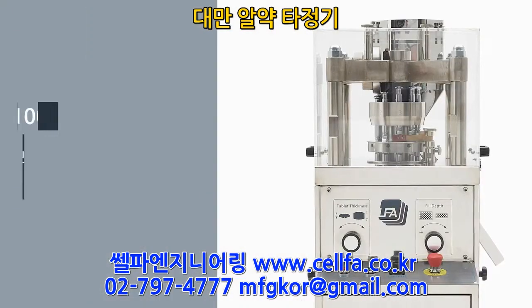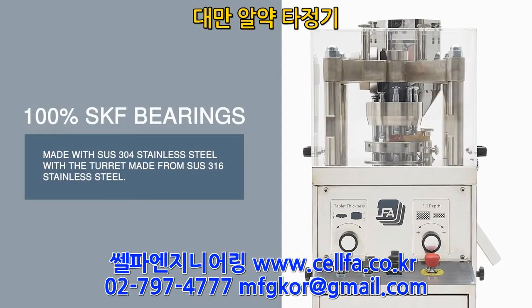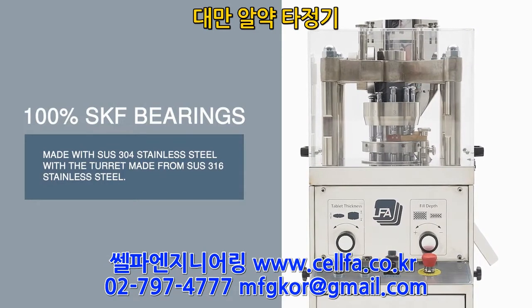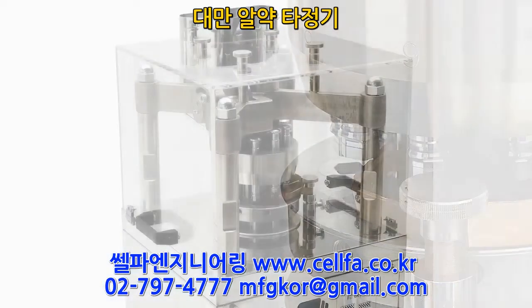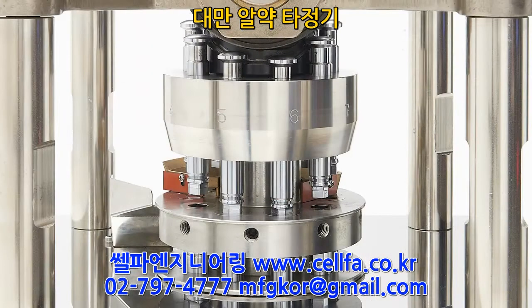The 118 has 100% SKF bearings and is made from SUS-304 stainless steel, with the turret made from SUS-316. This press is stronger, more reliable, with greater corrosion resistance.